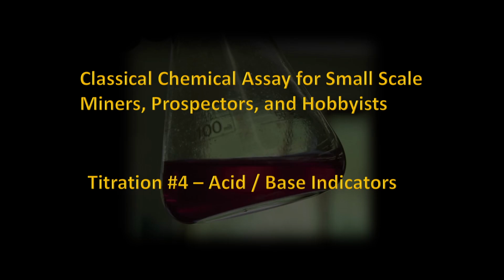In part 17 of my educational series titled Classical Chemical Assay for Small-Scale Miners, Prospectors, and Hobbyists, we covered some of the calculations regarding acid-base titrations, the requirements for an acid-base titration, and more. Chemical indicators and their use were also mentioned as endpoint indicators, but not discussed by any degree of complexity. In this presentation, the focus will be on what an indicator is, its relationship with pH values, and how to choose an indicator for an acid-base titration.